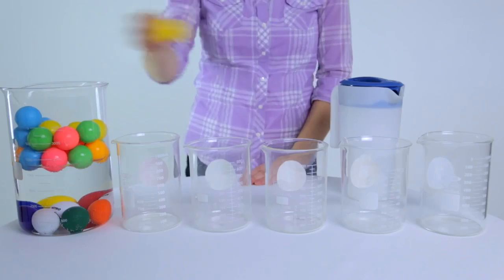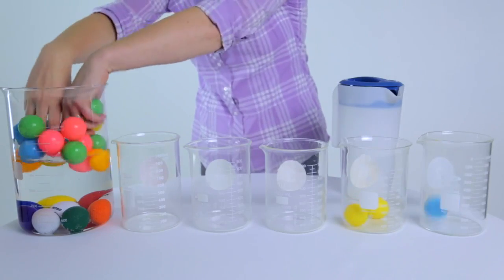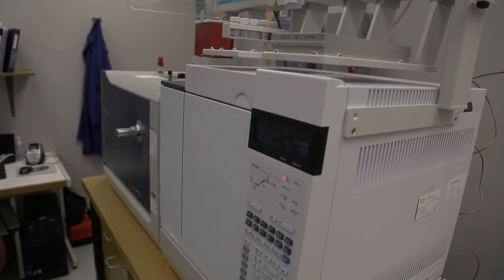The essential oil is then tested with GCMS testing. This process separates the oil into its constituent parts by sending a sample of the oil through a machine called a gas chromatograph.